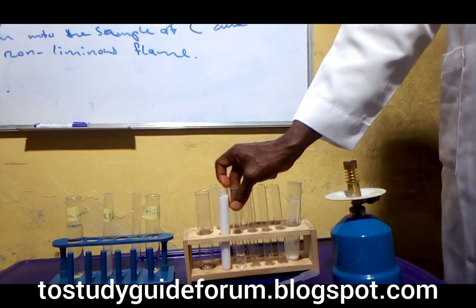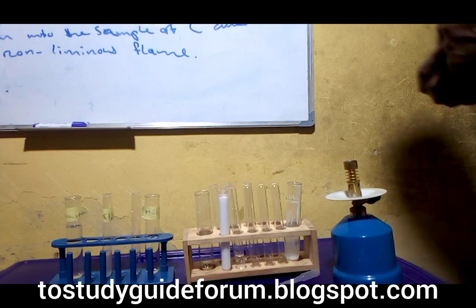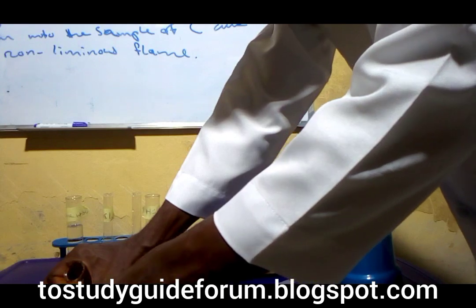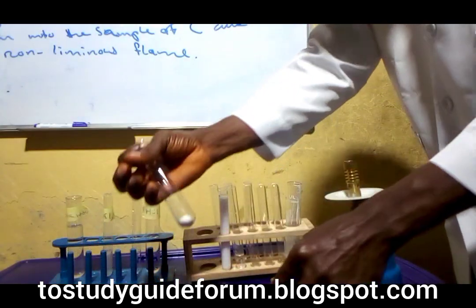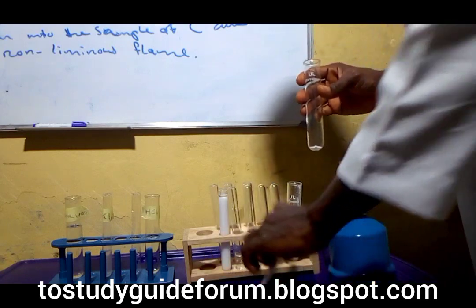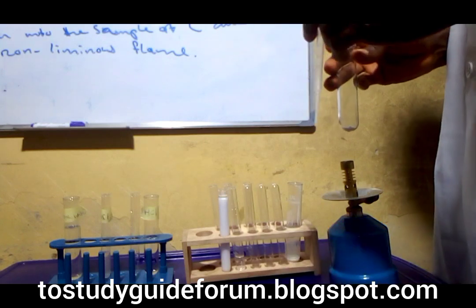We take another solid portion of C, put it into a test tube and add dilute hydrochloric acid, and then bubble the gas into lime water.